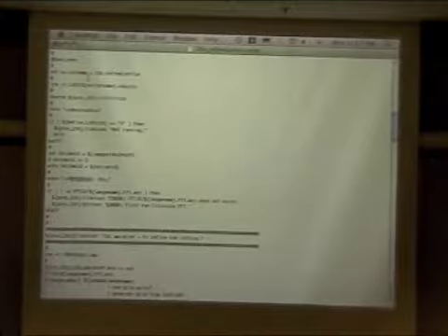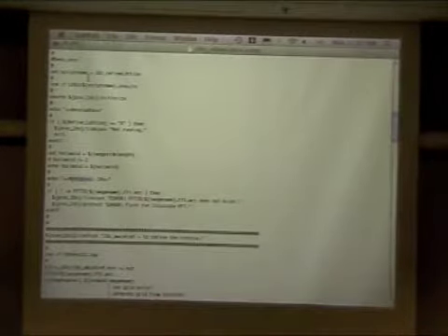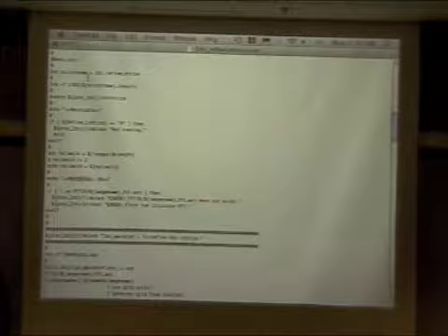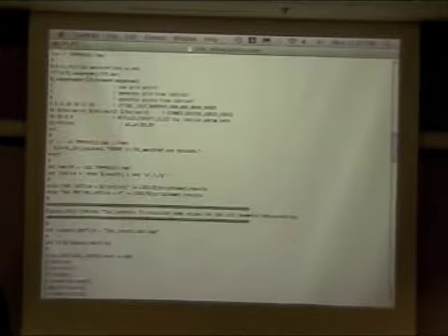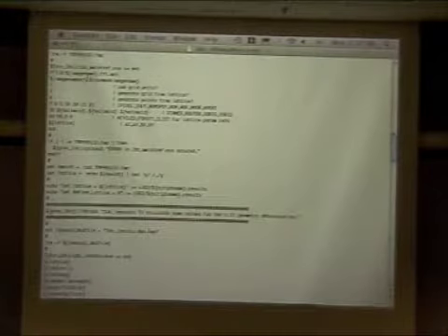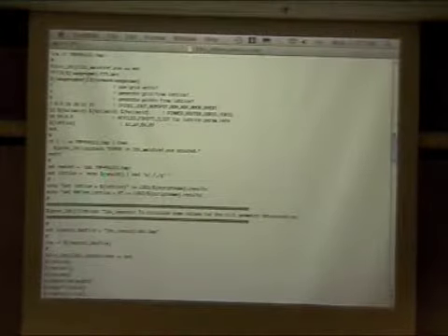And basically what's happening is 2DX is just sitting outside listening to the output of this program. And anytime a flag is thrown out, it automatically rips that out and interprets it as a command. There are a couple more things in here though. When you have, for instance, changed something, in this case refined lattice is actually taking the input lattice and then doing something to it, in this case using mmlatref, and then putting it into your refined lattice.